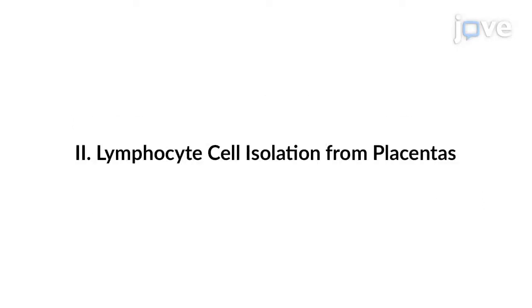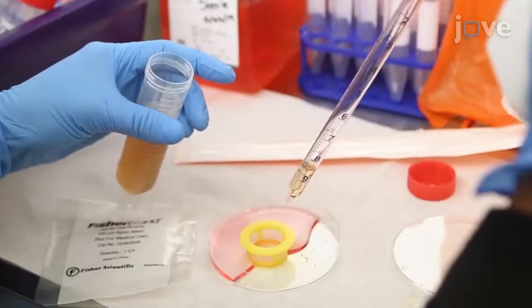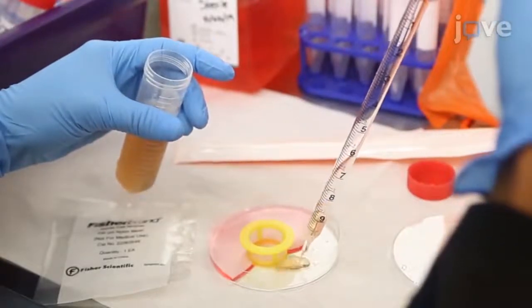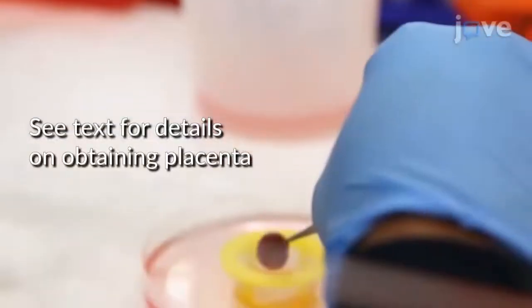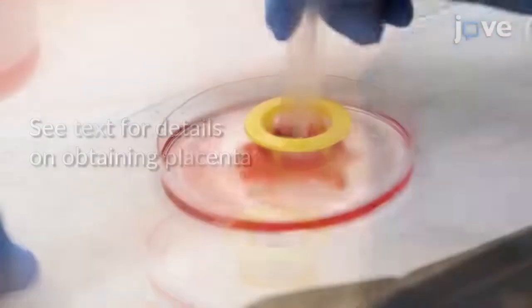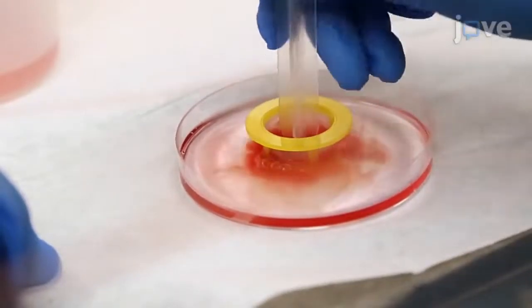To begin this procedure, add 13.5 milliliters of RPMI and 1.5 milliliters of FBS to a petri dish containing a 100 micrometer filter. Place one placenta on the filter and use the flat side of a syringe plunger to push it through the filter and into the petri dish.